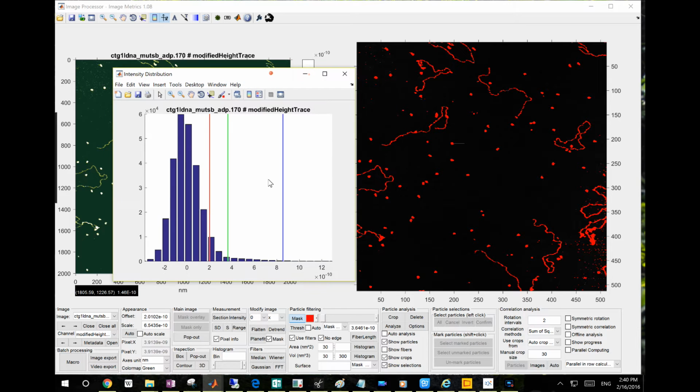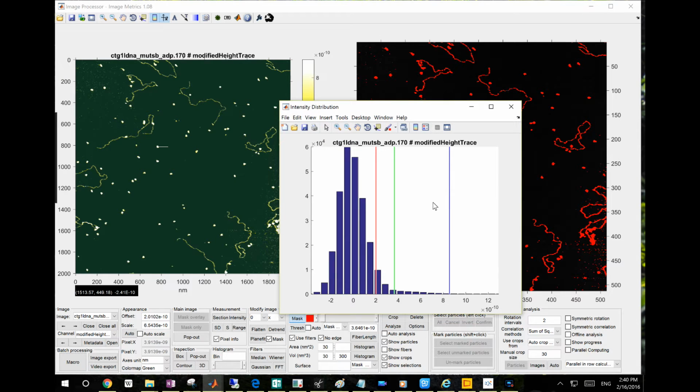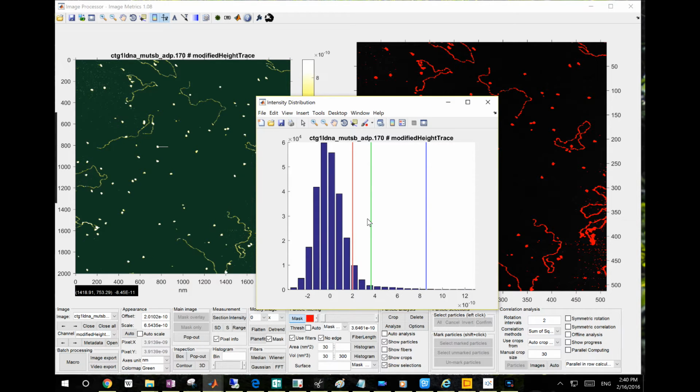So what does that mean? If I make the density slice between these, I only mask the molecules that are between this data range. Anything outside of it, anything higher or lower, is not masked. So let's see if I do a mask between slices.